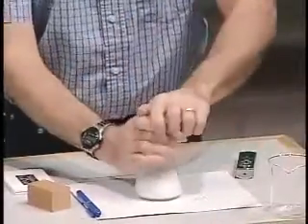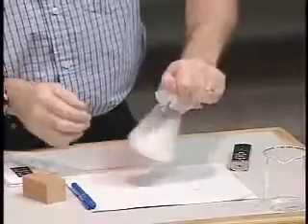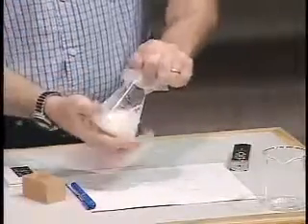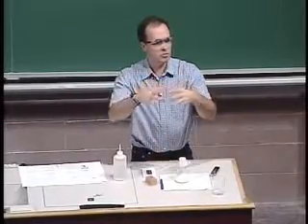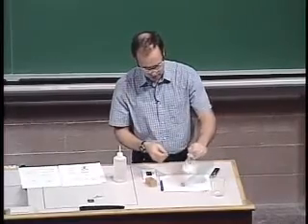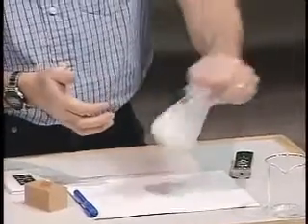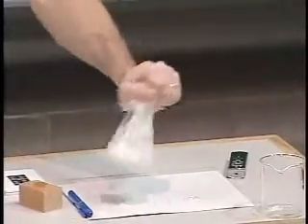And put the top on because it generates ammonia, which stinks. And I'm just going to mix it around here. It's an unusual reaction in that it's two solids reacting with one another. Now, you don't see that very often because the point of contact between the two solids is very small. Two spheres touch each other at a point, whereas two gases can completely dissolve in one another, and so you get a lot more reaction going on. But in some cases, two solids will actually react with one another.